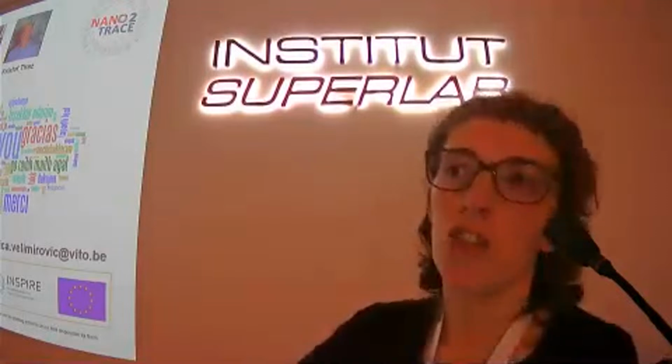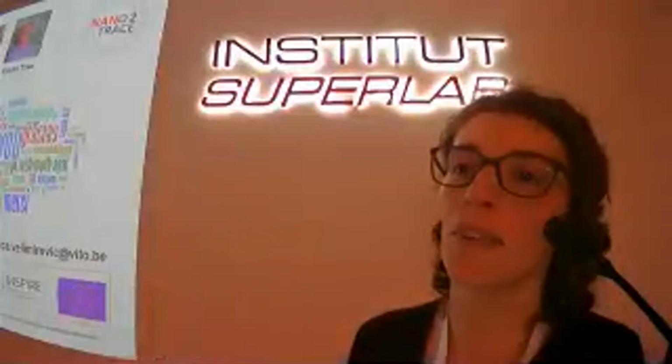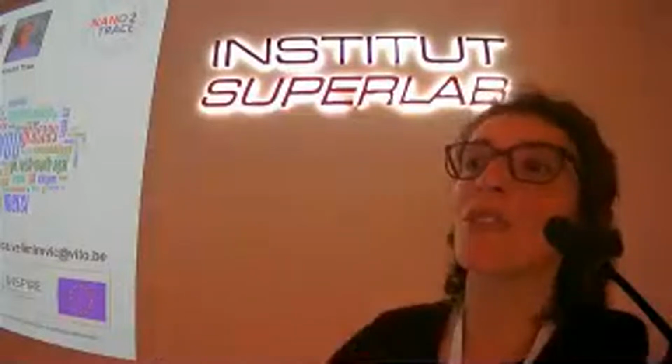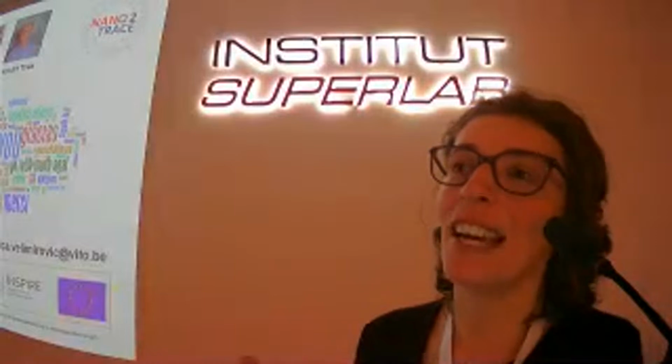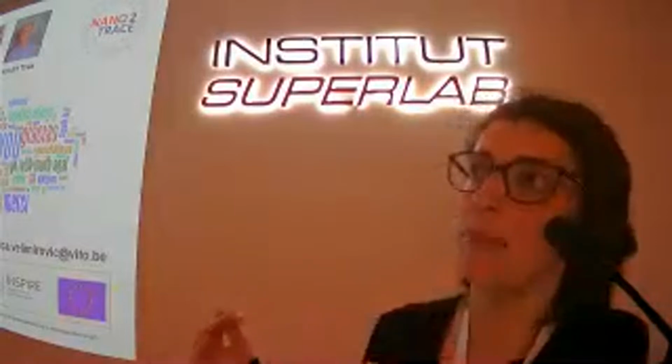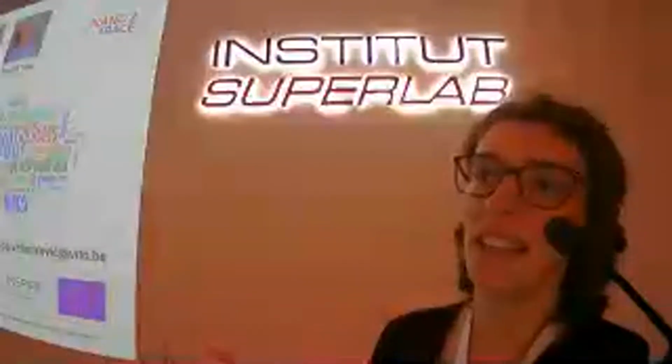So basically, there were several research groups doing the weathering, because the chambers are available, and there are some ISO standards for weathering per se. Of course, you also have different rays, and it's not 100% one-to-one with what happens in nature. But for some plastics which were weathered and analyzed by FTIR, you don't see the changes in the spectra.